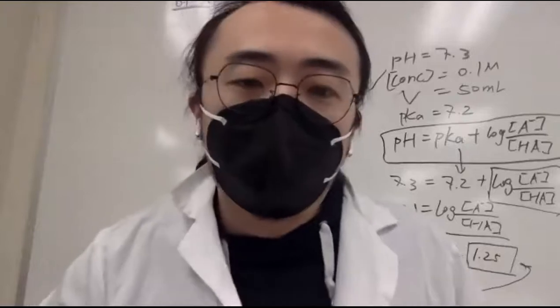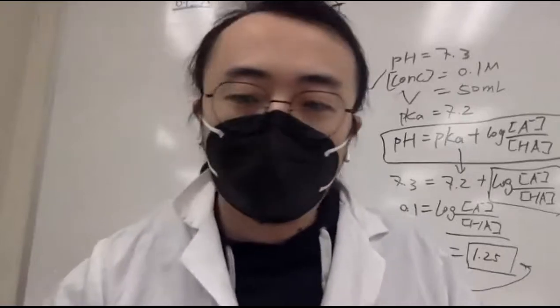All right, let's get started. For lab 2 today, we are going to learn buffer preparation and pH measurements.